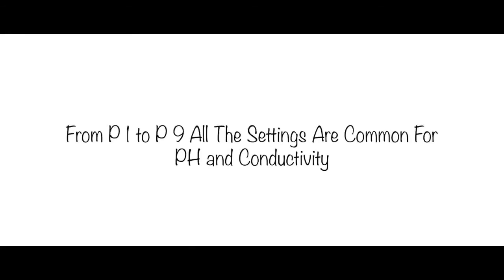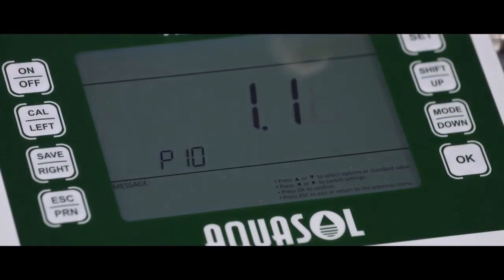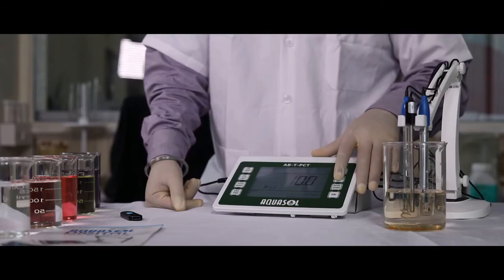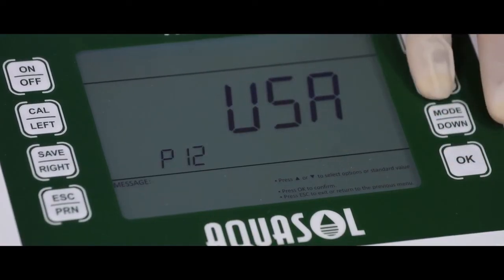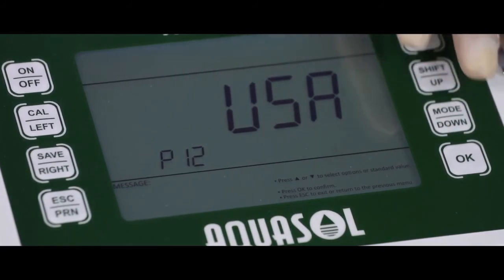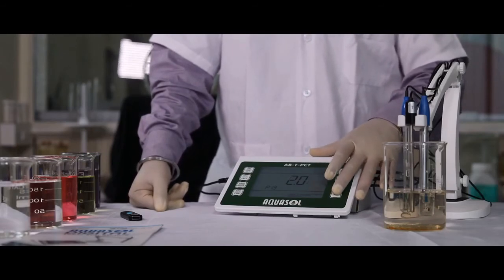For conductivity settings, change the mode to conductivity. From P1 to P9 is common for both settings. P10 is the conductivity electrode coefficient value setting. P11 is the conductivity electrode coefficient range setting. P12 is the conductivity standard solution selection — USA default. P13 is the temperature compensation coefficient.